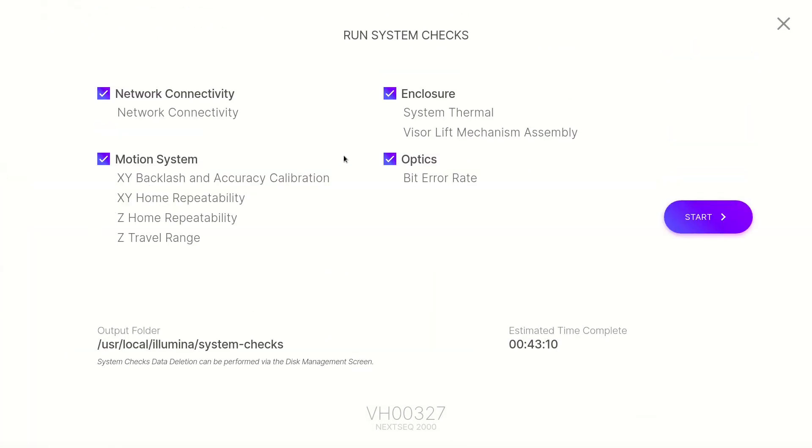Select the check box for any of the four system checks that need to be performed: Network Connectivity, which checks your network connection status and performance; Enclosure, which checks the performance of the thermal system and visor lift mechanism; Motion, which checks the travel limits and performance of the Z stage and XY stage; and Optics, which checks the performance of the imaging module.